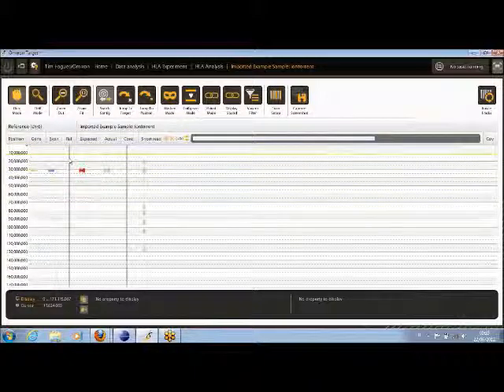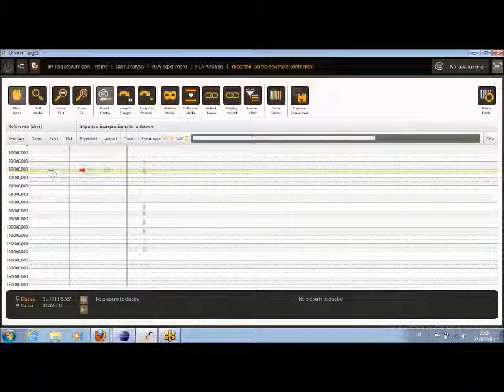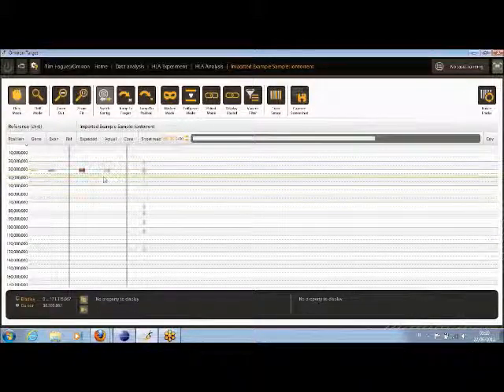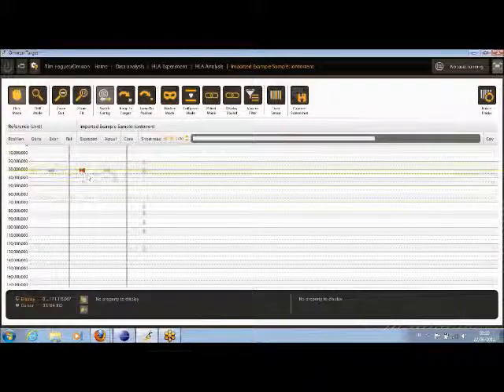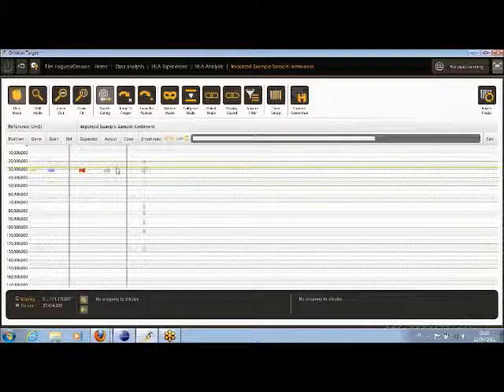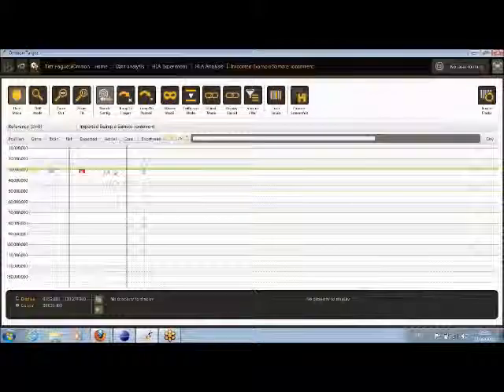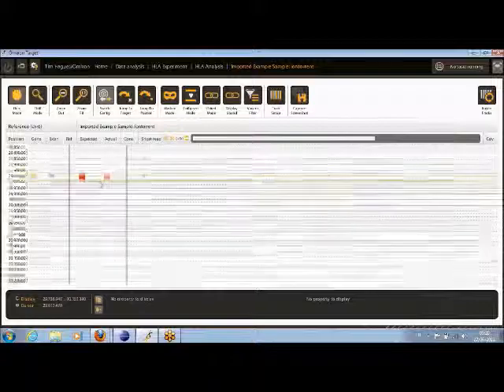This is going to be the reference sequence track along here. This is the genes and the exons that we're working with for this particular target. The reference sequence is chromosome 6, which is where all the HLA genes are. And in this case, we've also got an expected set of results. This is going to be displayed alongside the actual results in the genome browser automatically. Again, this particular data set is simulated data, simulated for the Ion Torrent machine.